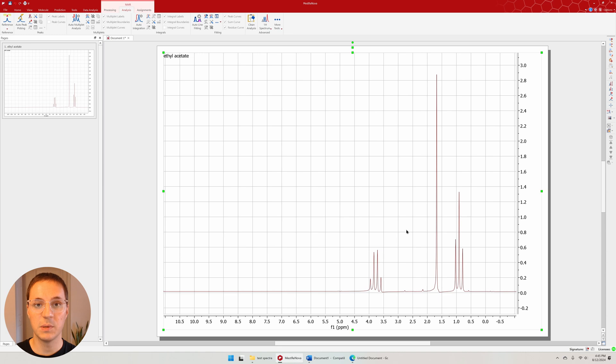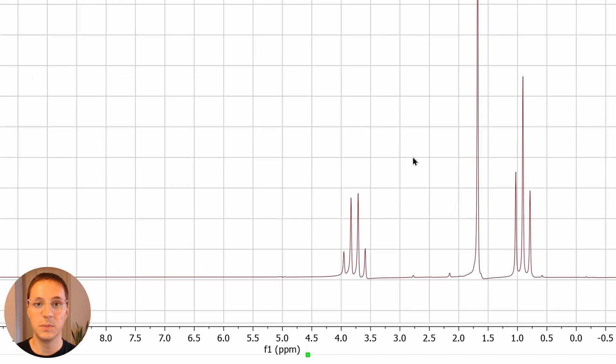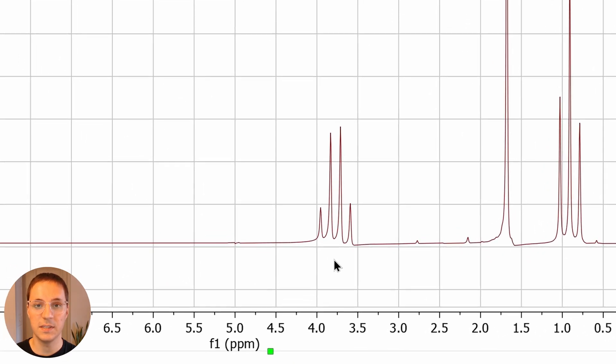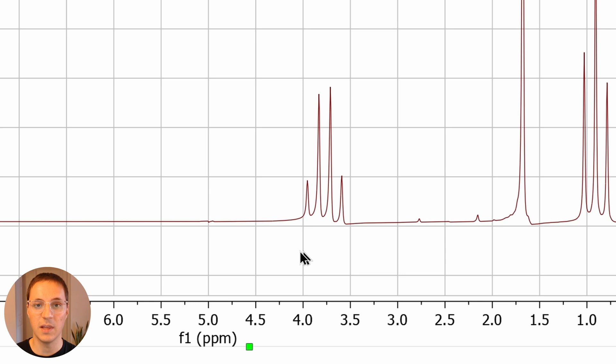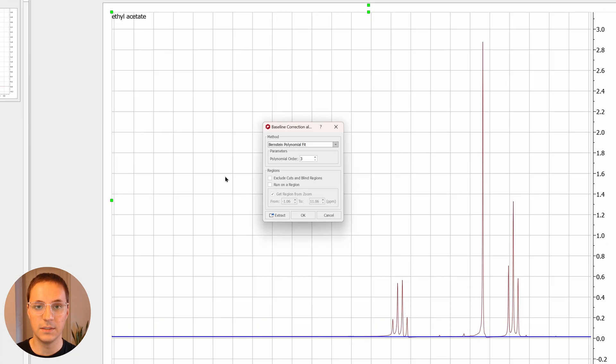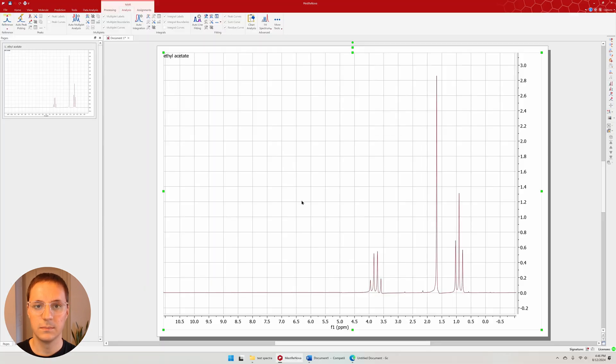The first step in processing our spectrum is to adjust the baseline and phasing. The baseline should be relatively flat and the phasing should be adjusted such that the baseline is the same level on either side of a signal. Press B to enter the baseline tool. The default settings will usually work. Press OK.